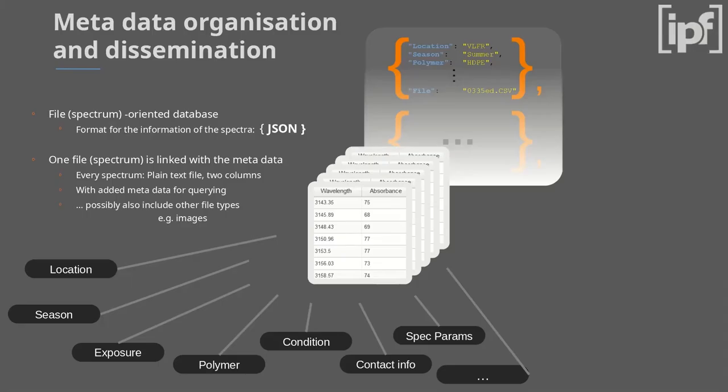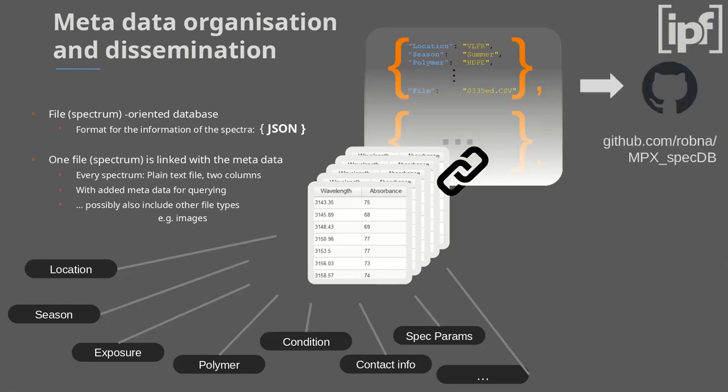So in this way, I organized a JSON file that collects all the metadata for every spectrum together with a link to this file name. So together these CSV files link to this JSON common description file, forming kind of a document-based database system that I can query against with any analytical tool I want.